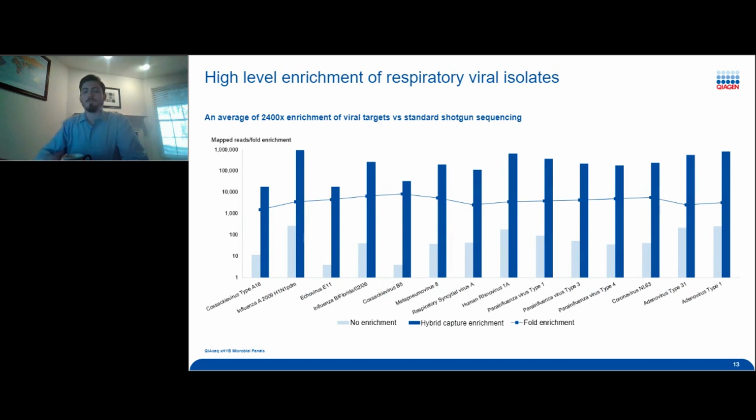Now, for a lot of different targeted viral sequencing, the only option at the moment is shotgun-based metagenomics, where you're doing whole genome sequencing of these viruses and looking only, bioinformatically, at your virus of concern. Now, this can be terribly expensive for reads on your sequencer, and also doesn't necessarily let you get as many reads as you want from viruses with low copy number in your sample.